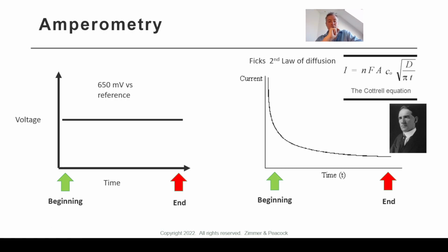It's a bit like earlier on, actually. When you're doing amperometry, if you stir and you have mass transport, you will have one current and a particular shape in your signal. And if you don't stir, you could have what we call the Cottrell response. It's a bit unusual for science, because I think in science we often expect steady state signals, just a signal that's kind of flat. But in amperometry, you get a signal that falls with time. This fall with time we call the Cottrell response. It's governed by the Cottrell equation.